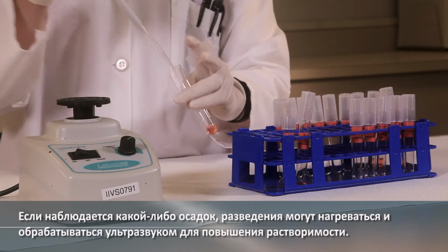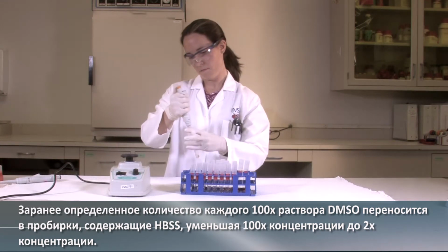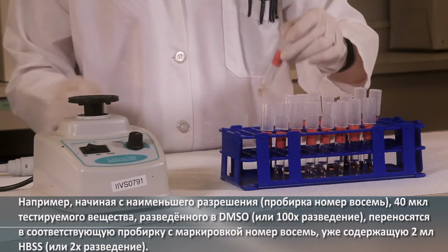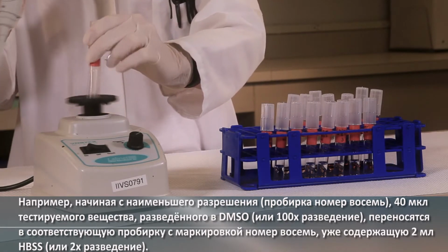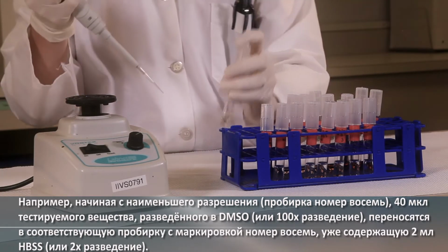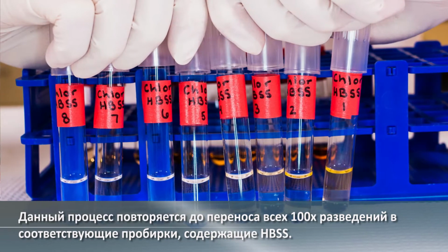If any precipitation is observed, the dilutions may be heated and sonicated to increase solubility. A predetermined amount from each 100x DMSO solution is transferred to tubes containing HBSS, reducing the 100x concentrations to 2x concentrations. For example, starting with the lowest dilution, tube number 8, 40 microliters of the test substance diluted in DMSO, or 100x dilution, are transferred to the corresponding tube labeled with the number 8, already containing 2 mL of HBSS, or 2x dilution. This process is repeated until all 100x dilutions have been transferred to the corresponding tubes containing HBSS.